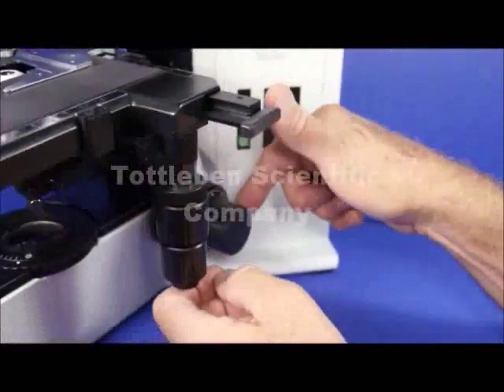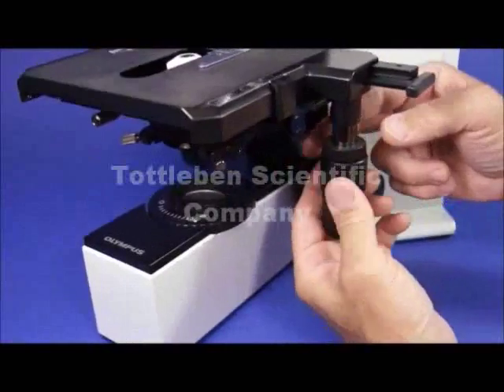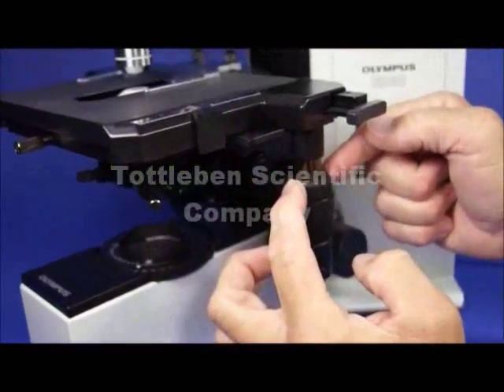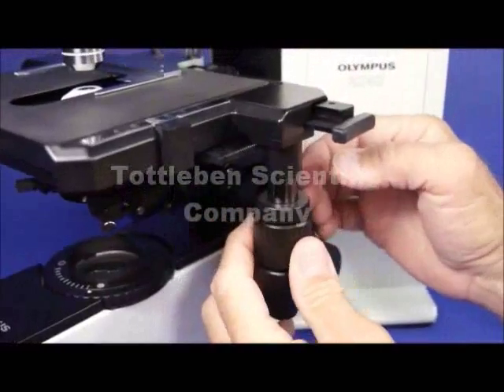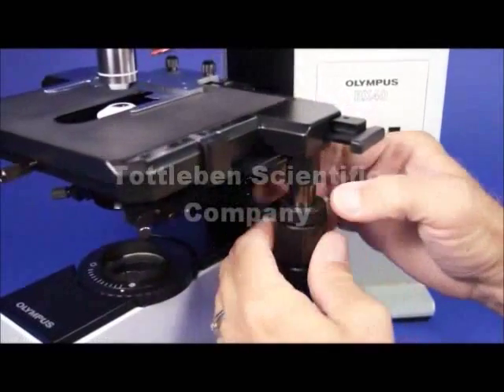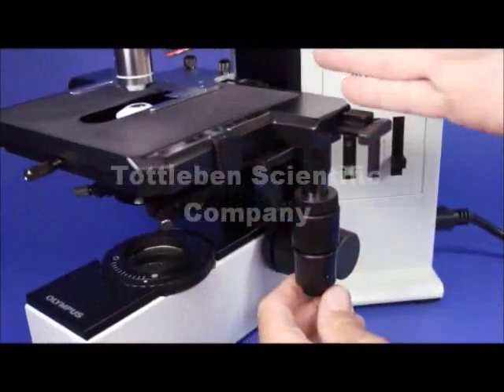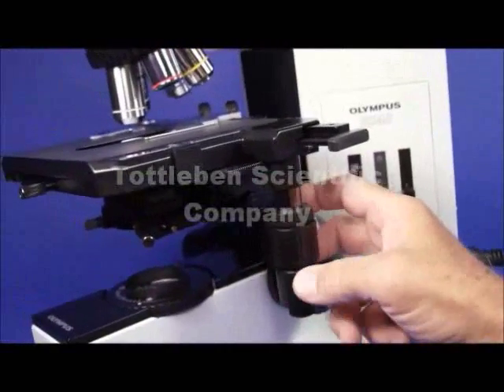It'll make it a little bit stiffer so it won't drop or drift on you. We also have the fine focus mechanism out here. This stage is very unique — it's self-tensioning. You just loosen this little ring right here and you've got a Y direction movement that's extremely loose. A lot of cytologists like that, so you can really speed through your specimens. On the X direction, you just loosen the bottom one and you can move very fast in the X direction on the stage.